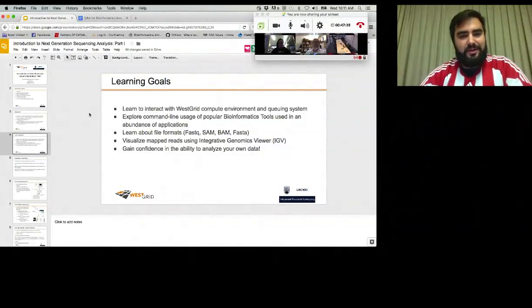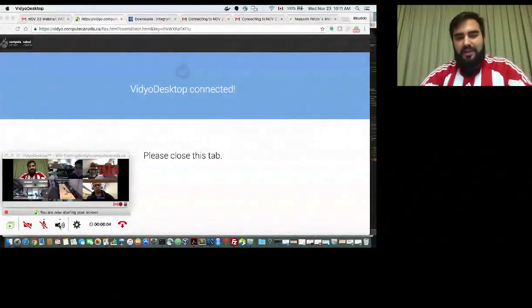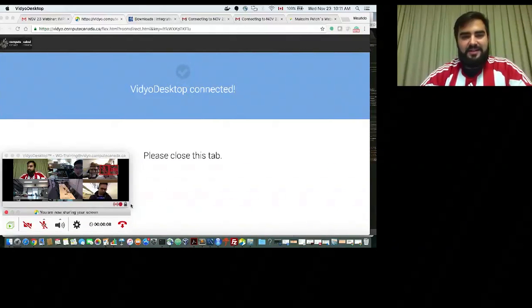All right, so some learning goals. At the end of this, I hope that you can learn how to interact with the WestGrid compute environment and queuing system. For some of you, this is going to be new. For others, maybe we can teach you something that you don't already know. We're also going to explore some of the command line usage of popular bioinformatics tools that are used in an abundance of applications. We will learn about file formats: FASTQ, SAM, BAM, and FASTA.